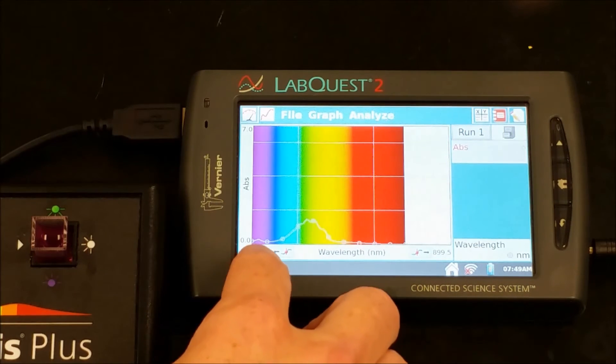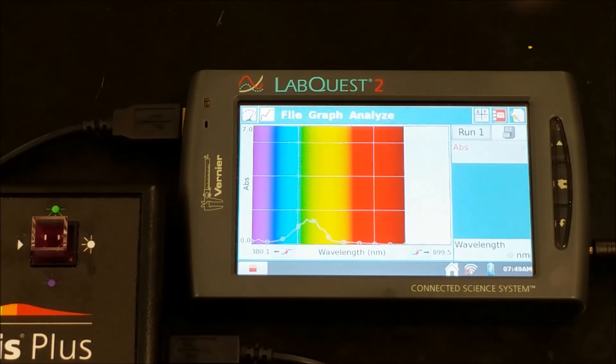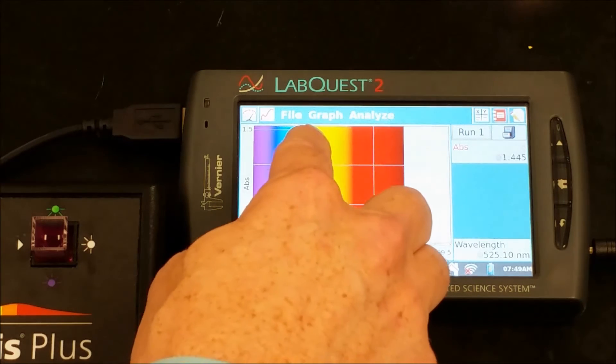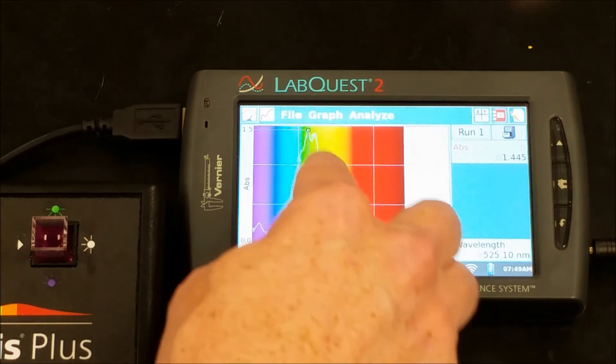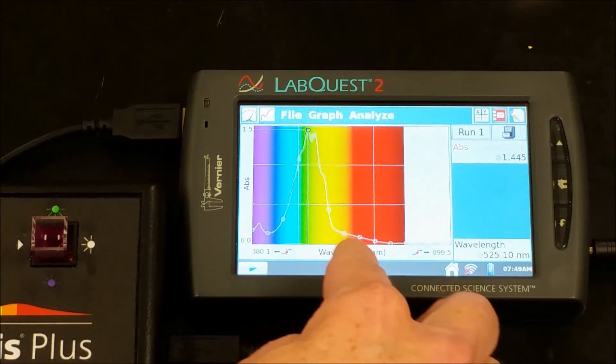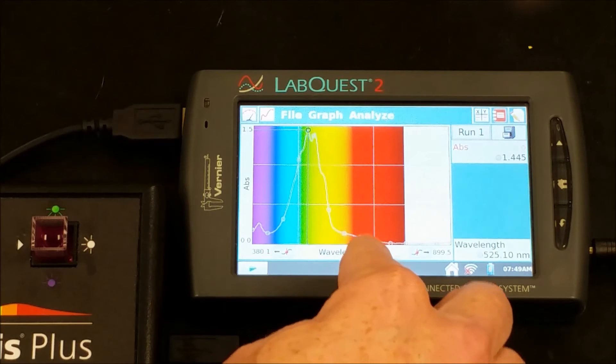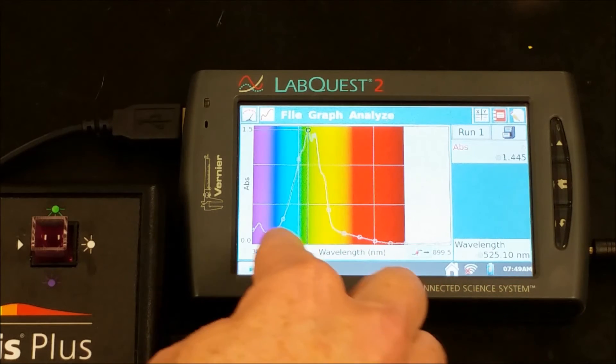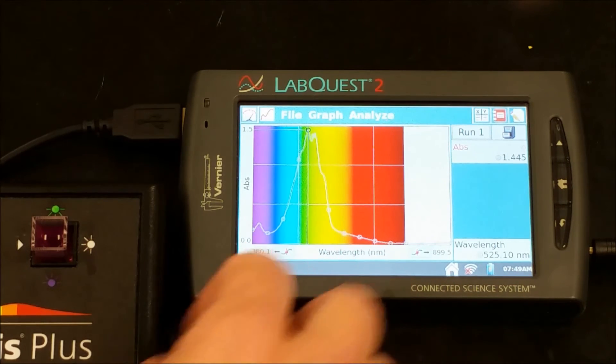Our final one is the violet solution. Here in the violet, we see a lot of absorption in green, a lot in yellow, and then that quickly tapers off. There's a little bit of orange and a little bit of red being absorbed, but mostly red is being transmitted, and most of the violet is being transmitted as well.